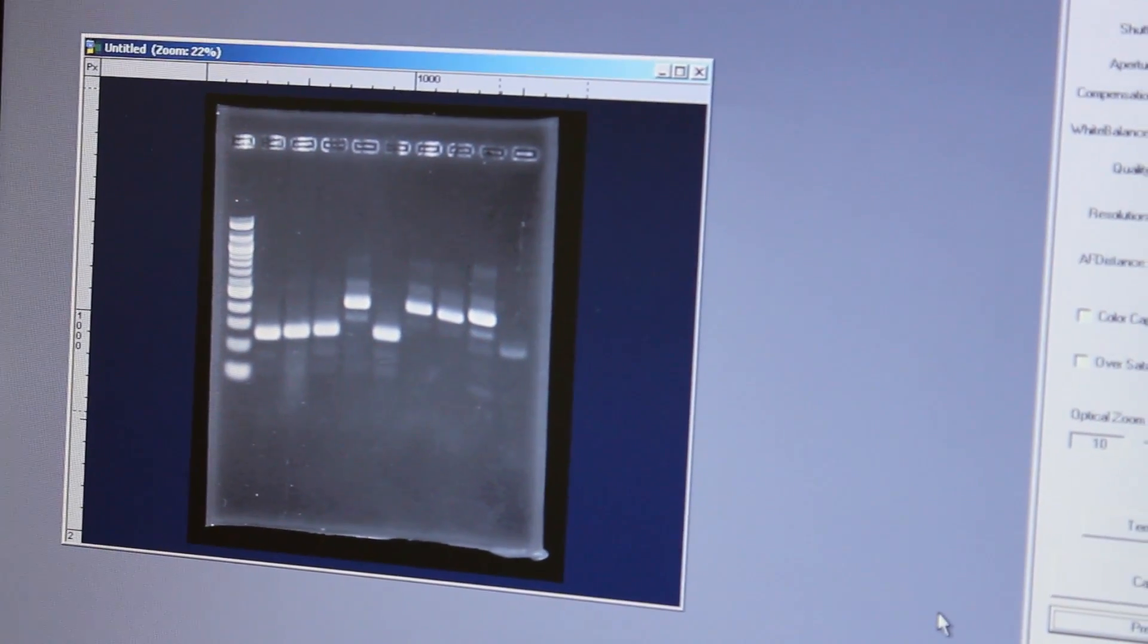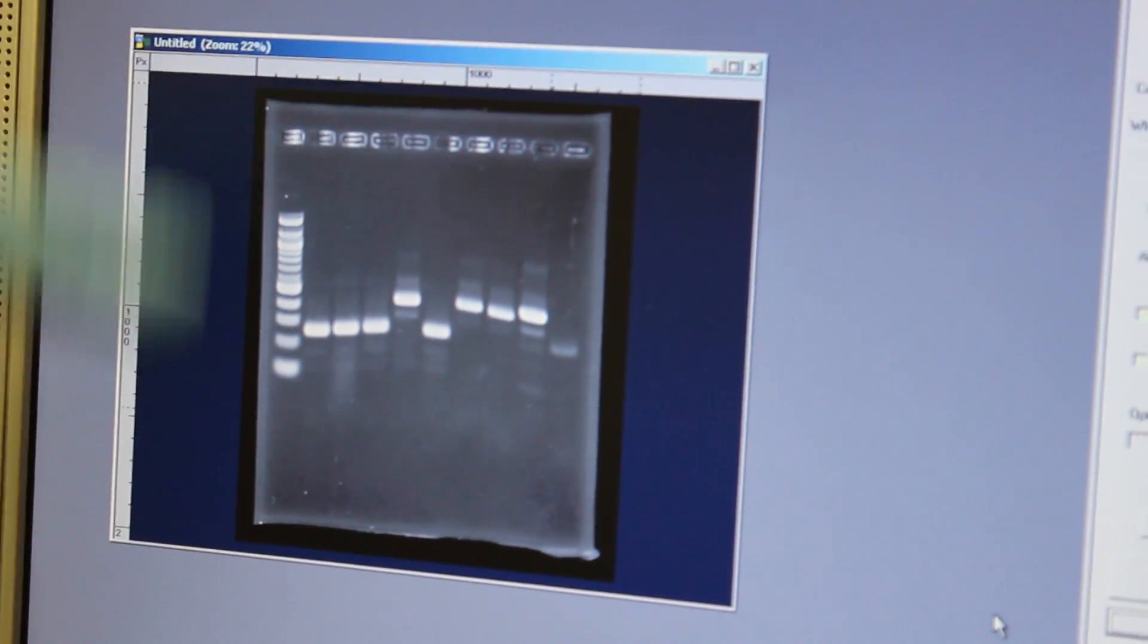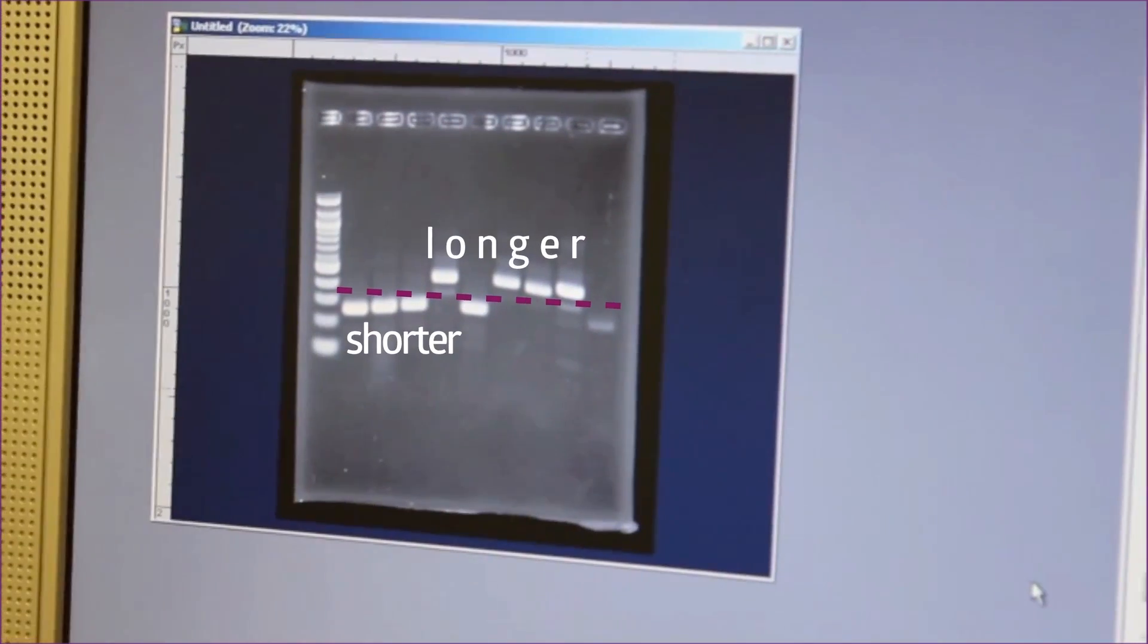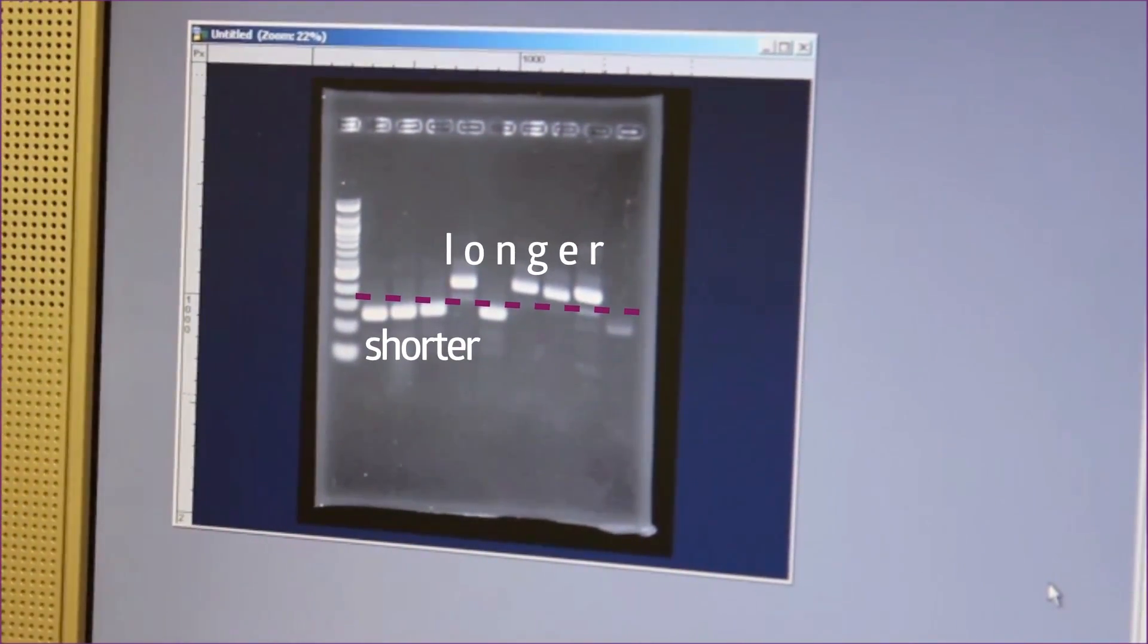Now what we can see is that all the samples worked well. The first lane is what we call a DNA standard ladder. A predetermined number and quantity of different sequences so we can determine how long the PCR products were from our reaction. There are two different length variations of the same DNA sequence region. So already we're seeing some variation across different species.